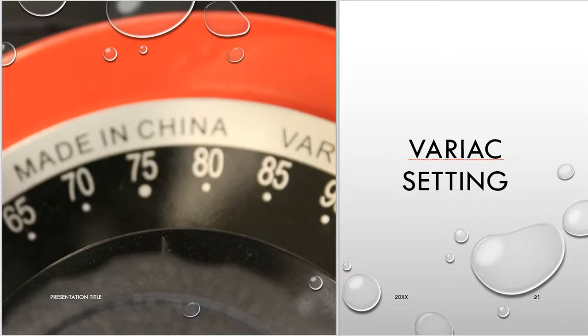All right, so here's a picture of the setting on the Variac. It looks like it's just a little bit above 75 on the dial of the Variac itself, which means that I'm about at the halfway point. I'm not cooking on super hot heat, but yet I'm not cooking on low heat either. I'm kind of right in the middle. So I'm just going to leave it here.